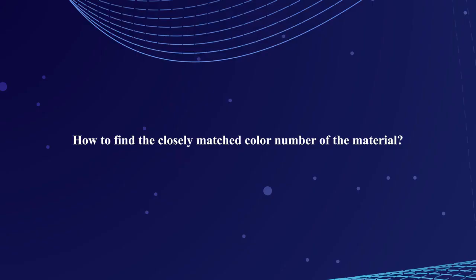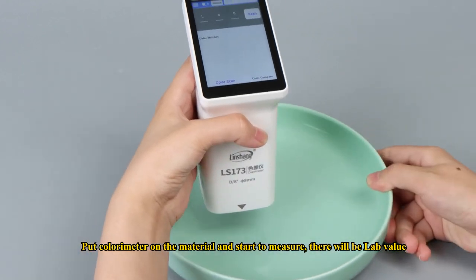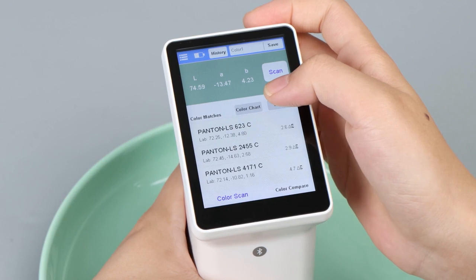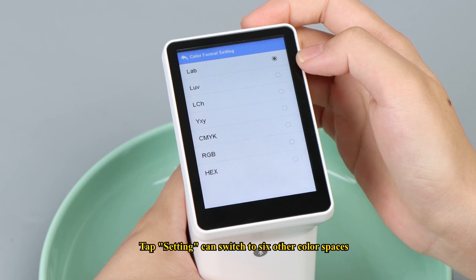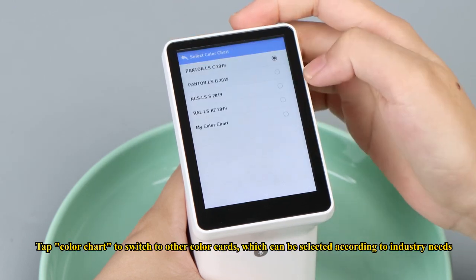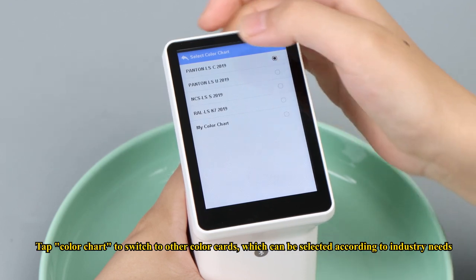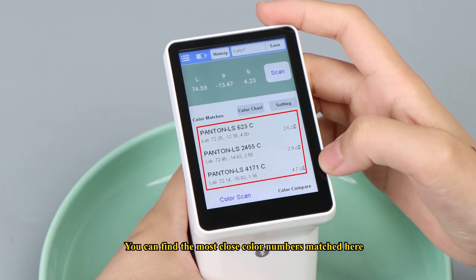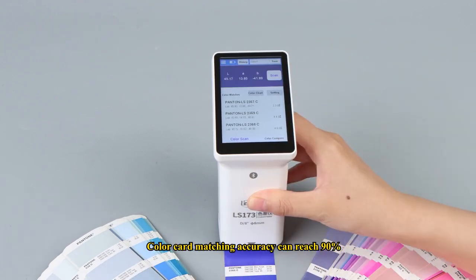How to find the closely matched color number of a material? First, switch to the color scan function, put the colorimeter on the material, and start to measure — there will be L, A, B values displayed. Tapping settings can switch to six other color spaces. Tap color chart to switch to other color cards, which can be selected according to industry needs. You can find the most closely matched color numbers here, and color card matching accuracy can reach 90%.